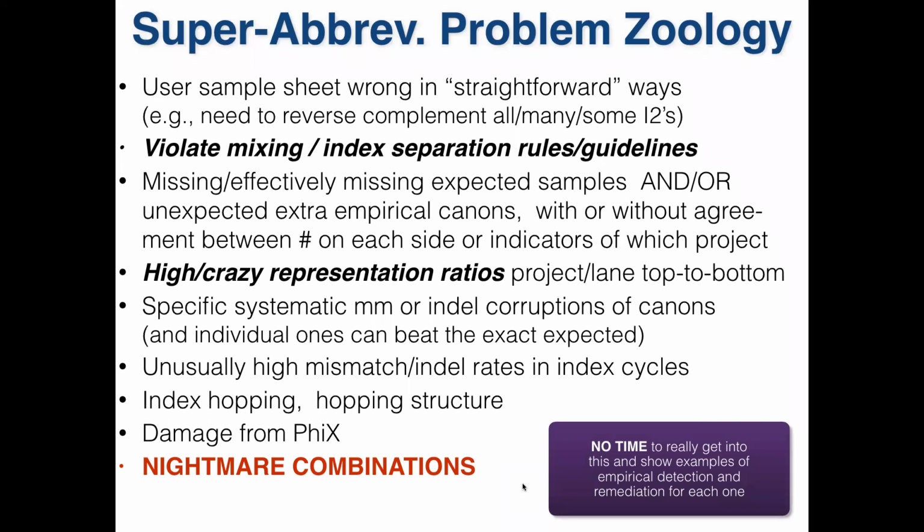But yeah, you get cases with 1 missing, 1 extra, 1 missing, 3 extra, 12 missing, 6 extra. Sometimes you get 6 missing, 8 extra. Yeah, whatever. I mean, things happen, but resolving those cases in terms of recovering samples can be tough. But at least you can find information that helps try to figure it out.